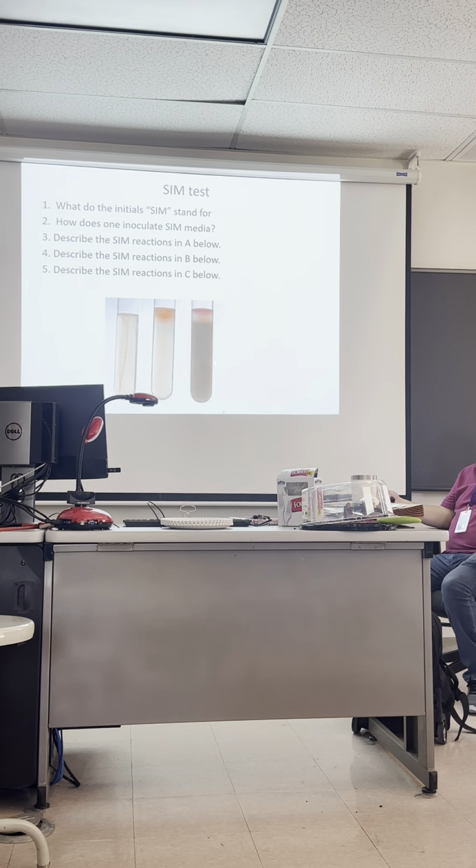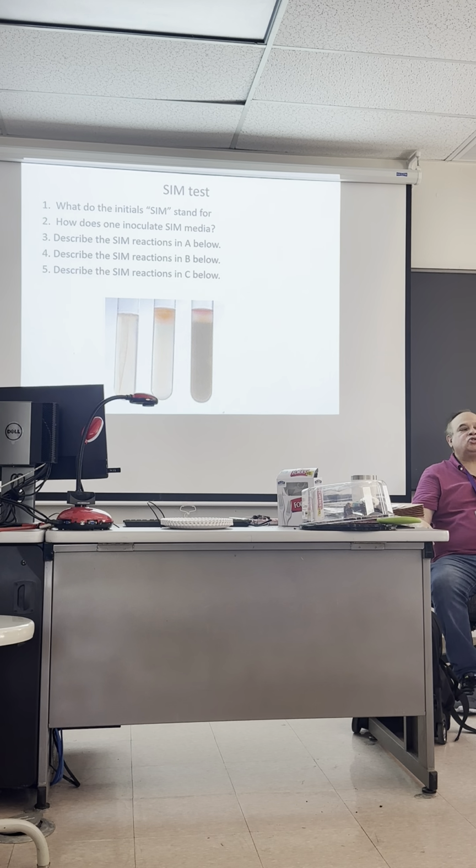So the last one here, I've got black there, I've got red there. So S, okay, you assume it's motile, right? Positive, positive, positive. That's correct. So what have I asked? What is the substrate in the SIM test? You'd say what?